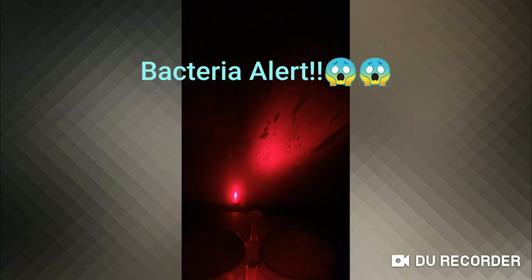Yes, you can see here a lot of bacteria in this single drop of water. Actually, this is water I used to wash my hands, so it's very contaminated right now, and you can see all the bacteria present in this drop. I'm trying to focus it because it's very difficult to record and hold this laser and focus it up. I'm trying my very best.